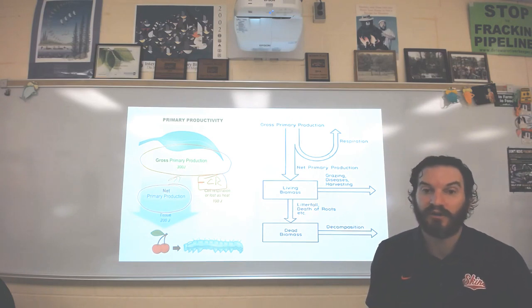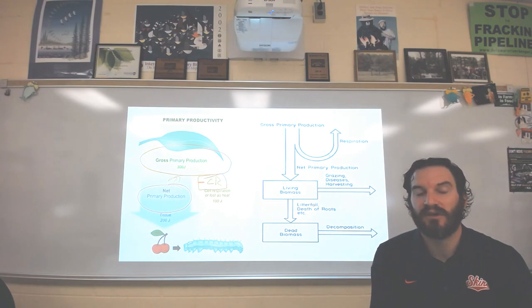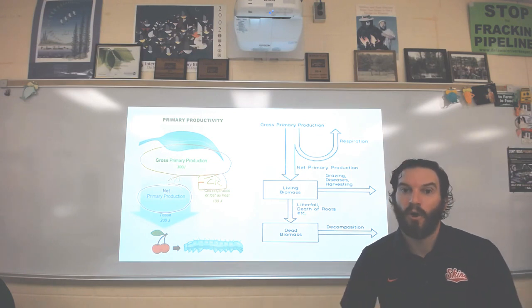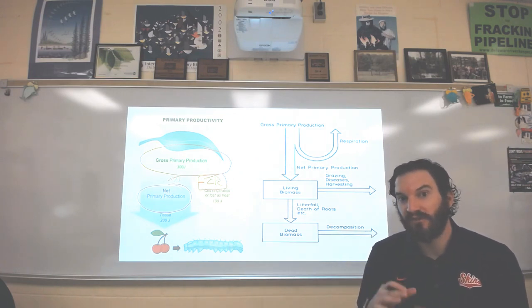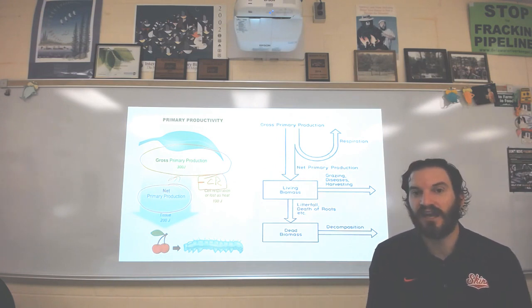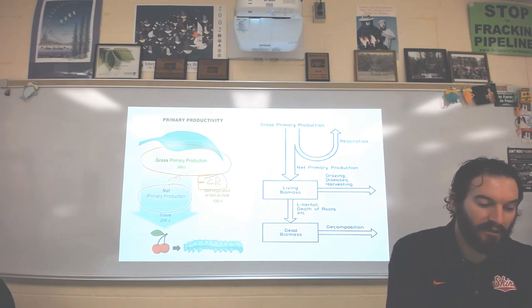So what we are going to do is take that premise, the idea of looking at how productive an ecosystem is, and translate it to the Neshaminy Creek. Hopefully what we're going to see is whether Neshaminy Creek is overly productive, meaning that it could support more life, or is it right around equilibrium, where it's kind of right where it's supposed to be? Or is it on the converse? Is it detrimental? Is it negative, and needs more support and needs to cut back on the amount of organisms in there? So hopefully we'll see that. Now, how are we going to do that?